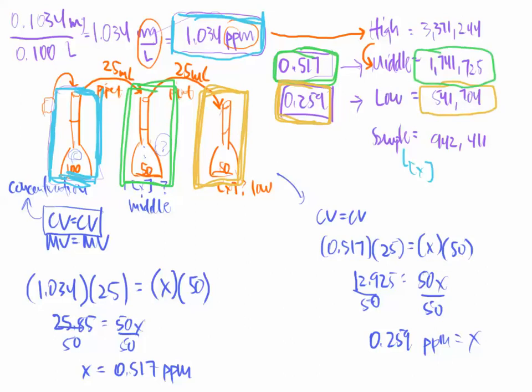All right? So slowly but surely, we are working ourselves up to a calibration curve. But this is what has to go on beforehand. You have to know the concentrations of the standards that you have made. You end up making one most of the time originally from the very beginning.